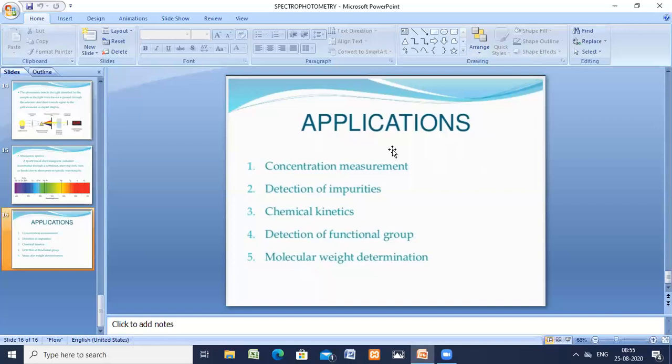In the colorimetric determination, excess of KCNS is added. Strong acids like HCl and HNO3 prevent the hydrolysis of Fe3+. H2SO4 is not used because sulfate ions again form complexes with Fe3+. The color is measured at 480 nanometers. Standard iron solution is used and the process is repeated for the construction of the calibration curve.